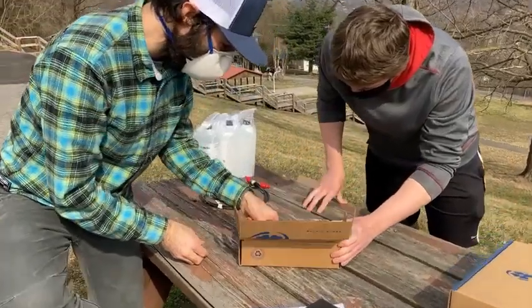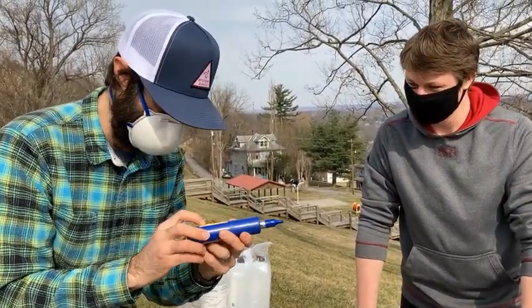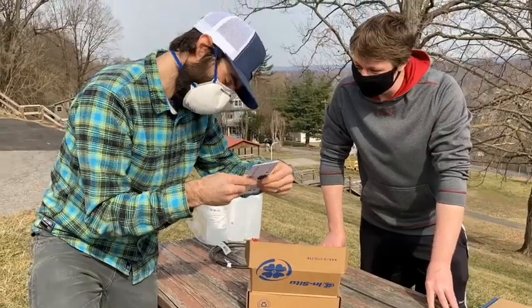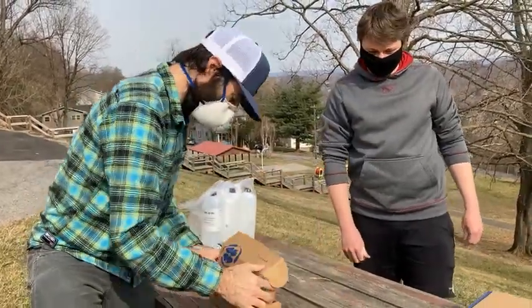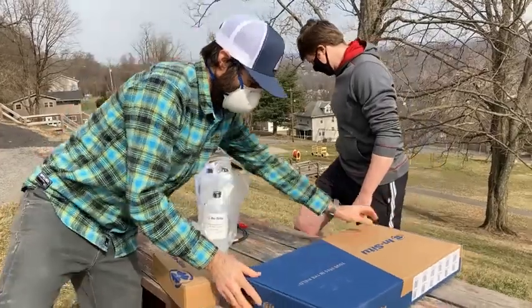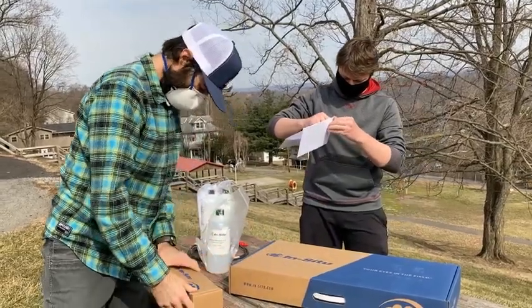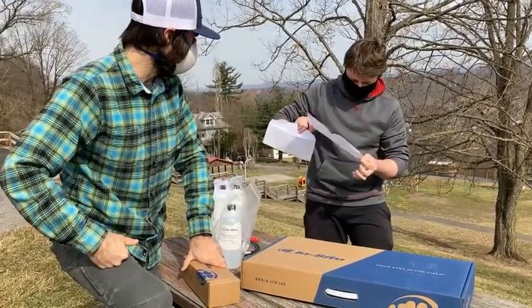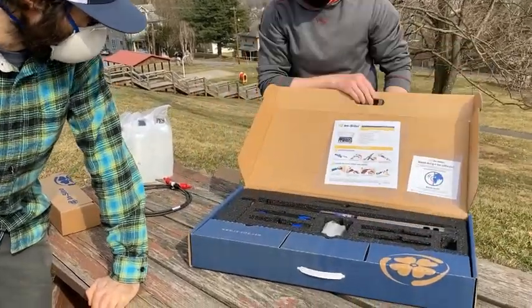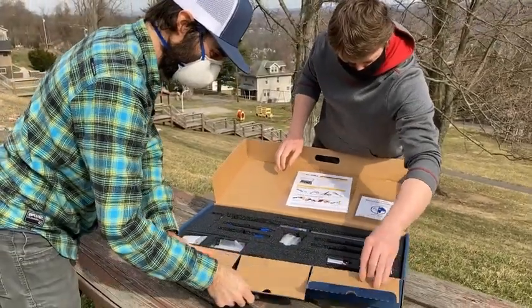Let's start with the smaller one. Oh my goodness, we have a little blue thing! It has the power button, I think. Where's that instruction manual, Brian? I hope it's in here — I am too excited to wait, let's go into the big box. There's one more thing in here — oh, what's this? It's a packing list!